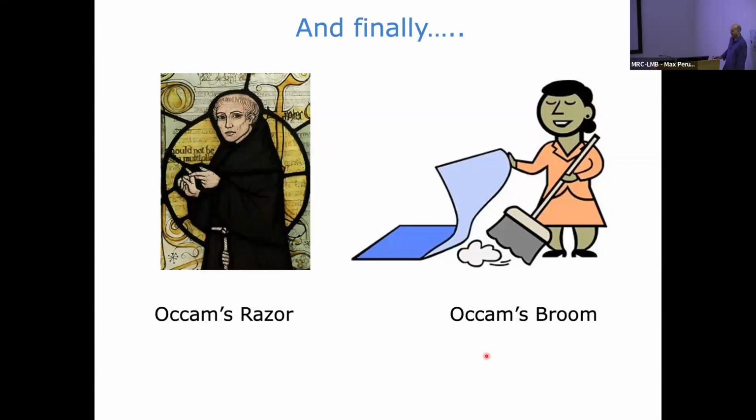I just had a question about the replicates, on separate days, for example, which is something that happens all the time, and you do see differences. What is an appropriate way of dealing with that? Would that be a case of looking at the graphs separately, assessing them individually, and then normalizing internally and then combining? No, that's a no-no.